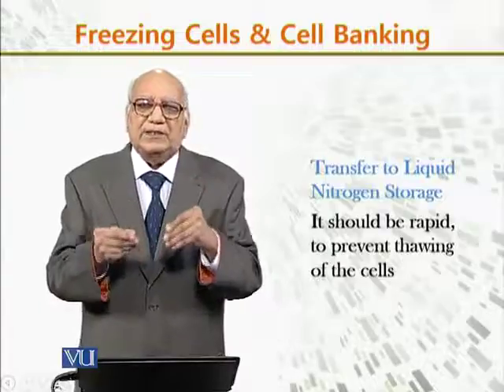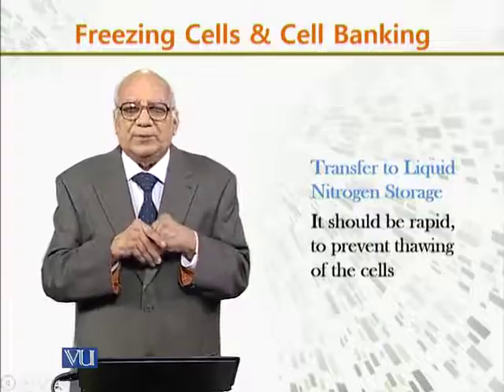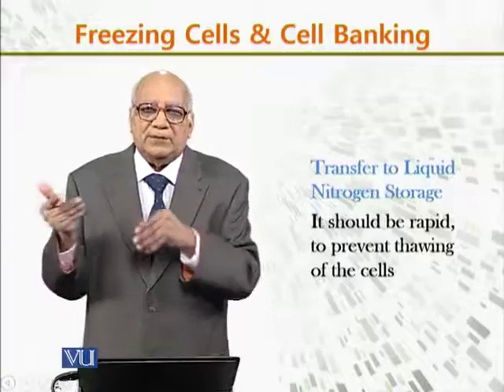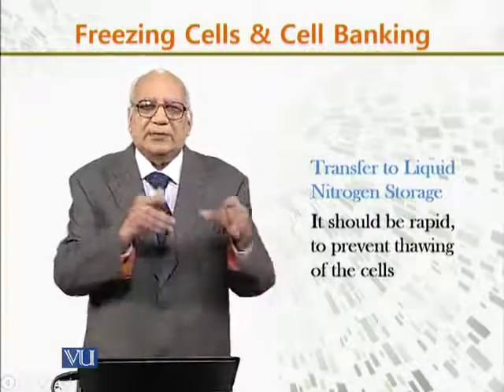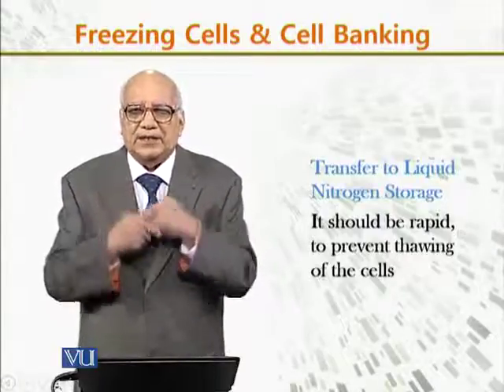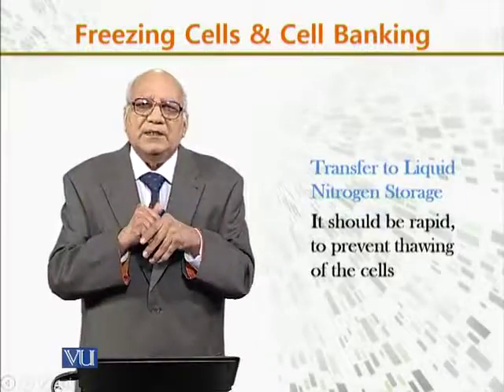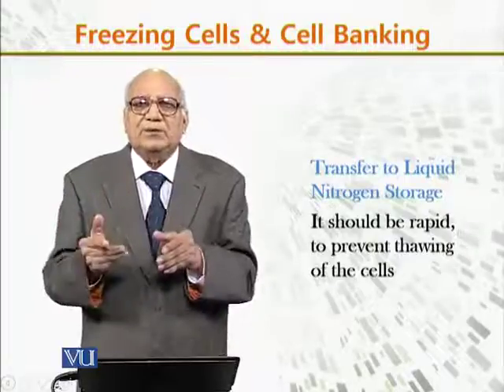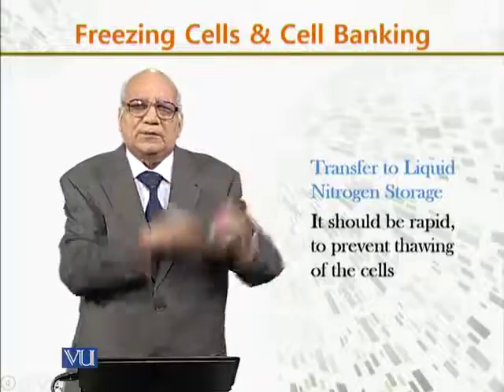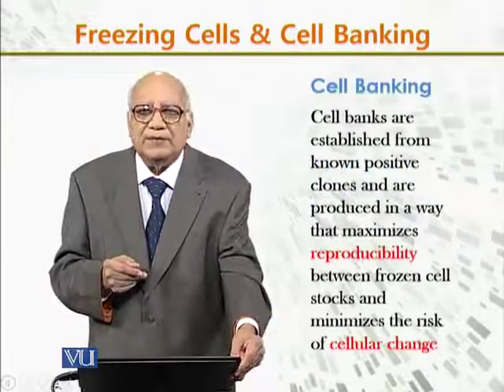When we transfer it to liquid nitrogen, it should be rapid to prevent thawing of the cells. That is, we take them from that container and put them into the cryogenic storage cylinder, which contains liquid nitrogen. This process should be very quick. It is not that we take those cells in the morning and put them in the liquid nitrogen in the afternoon. No, because they will thaw.